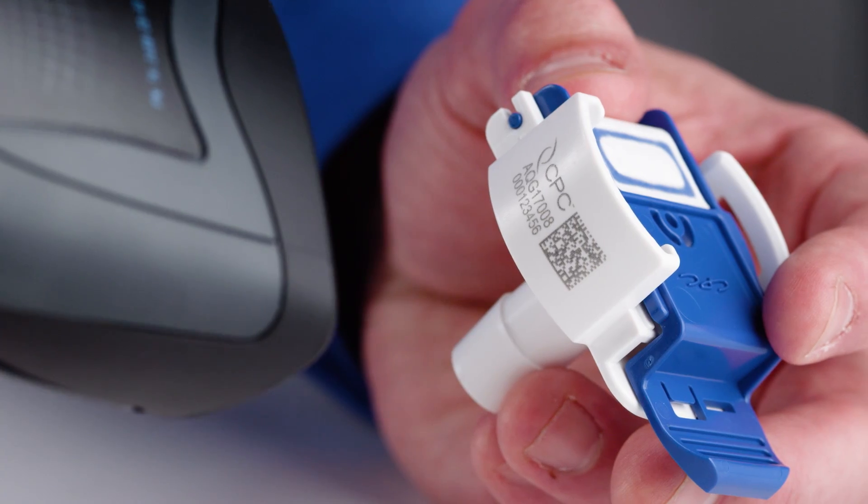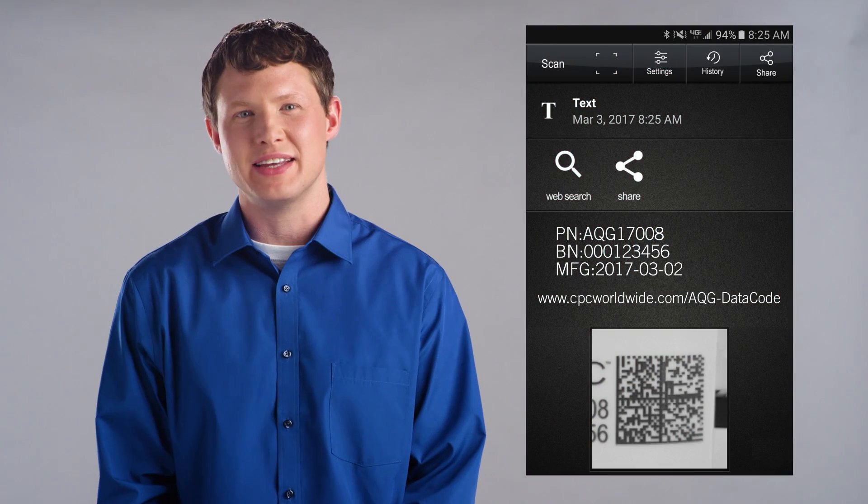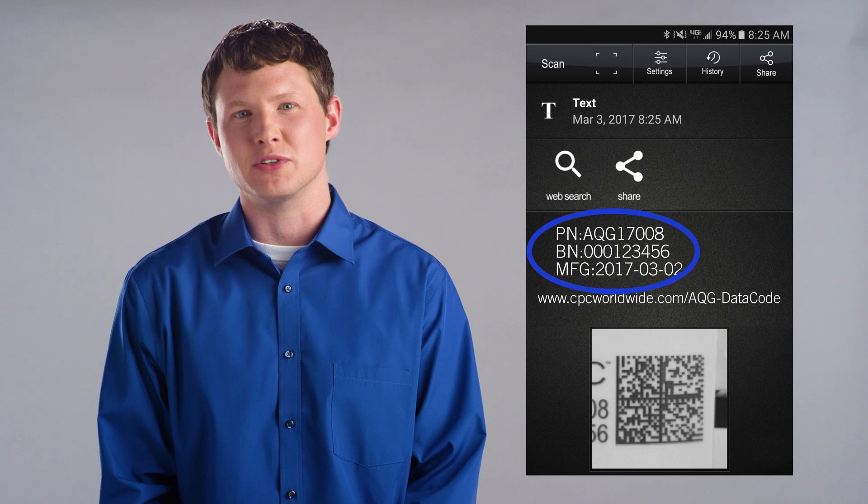By scanning the AseptiQuik data code, bioprocessing technicians and quality personnel can easily identify the CPC product and batch number even if it's part of a single-use system.